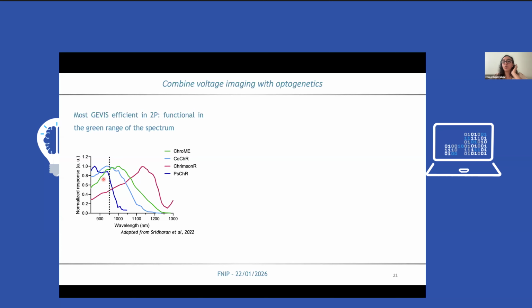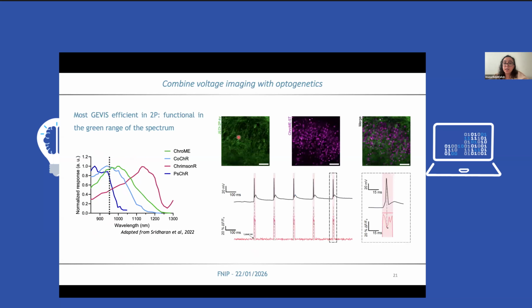So we know for now that we are photostimulating, but we never know for 100% if the cell has spiked or not. And so actually, we could take advantage of this huge crosstalk that we have here and use the single beam that we use for photostimulating, just add a voltage indicator to these cells and record the response from the cell. So we tested this on organotypic hippocampal slices.